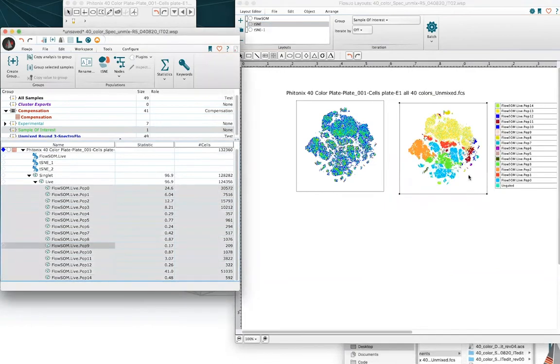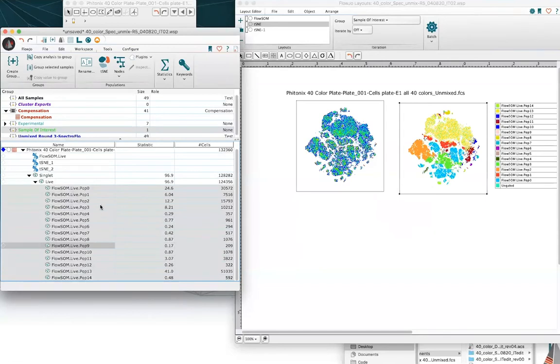However, this is going to get a little bit messy at certain times. Here we have a small enough number of clusters that maybe it's not so bad, but it's a little bit difficult to tell, say for example, where cluster 8 is relative to cluster 13 because they're different shades of yellow. So I'd like to actually batch across all of the clusters and see them overlaid onto t-SNE. To perform an overlay, we just drag and drop our populations of interest onto the t-SNE plot.